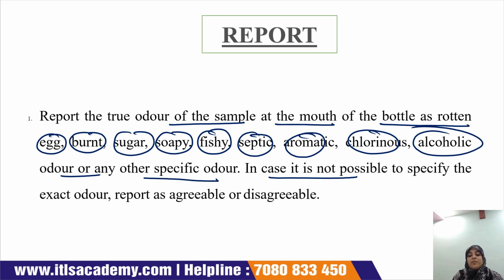In case it is not possible to specify the exact odor, report it as agreeable or disagreeable, meaning acceptable or not acceptable.